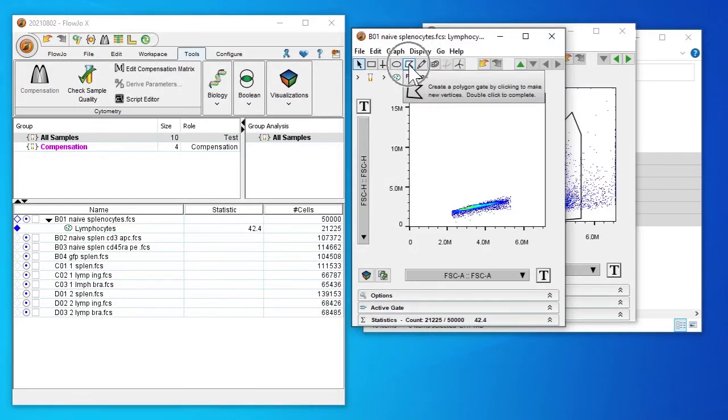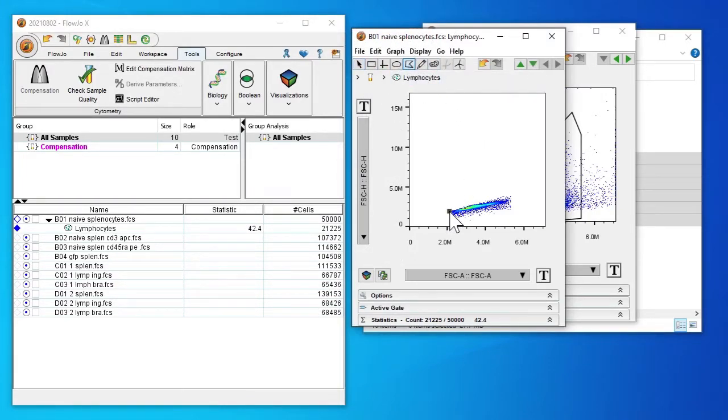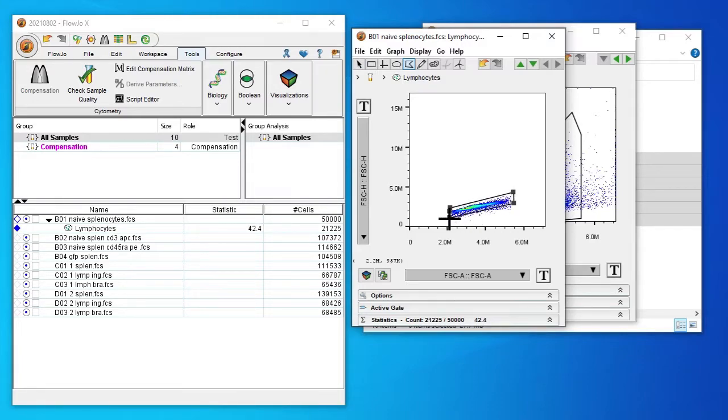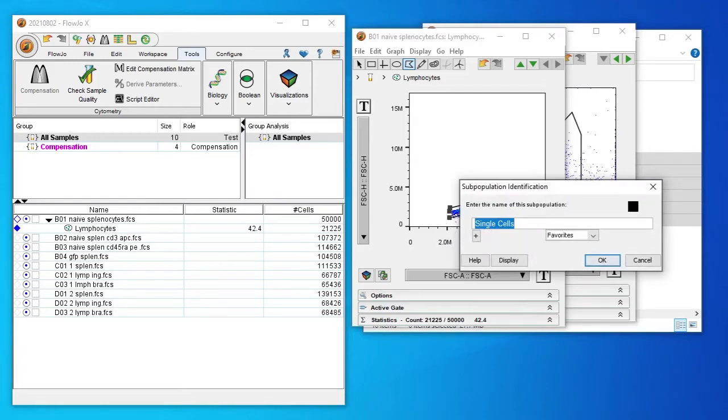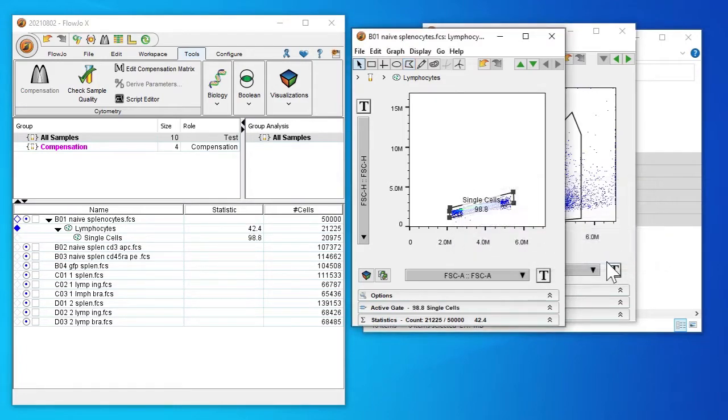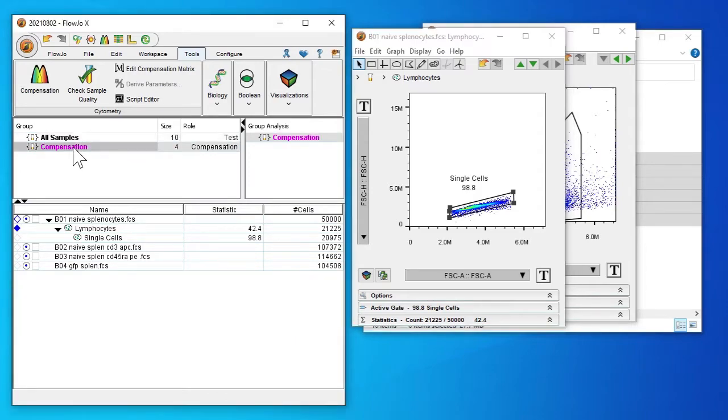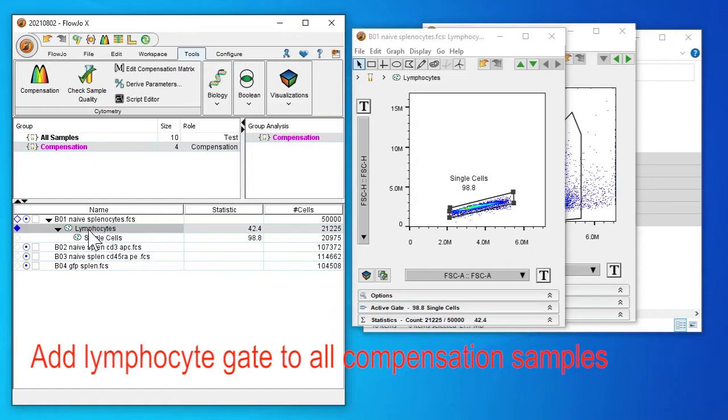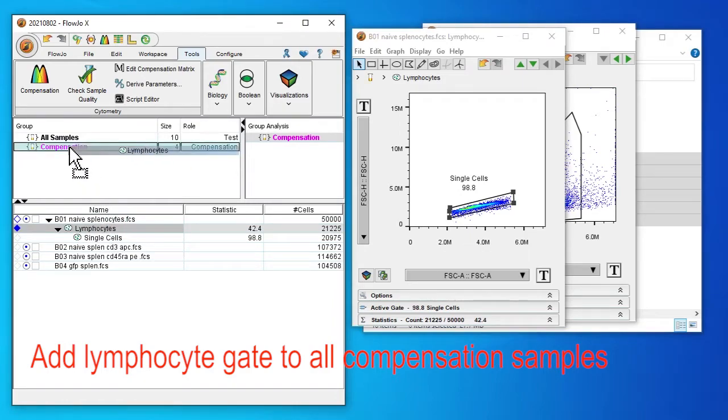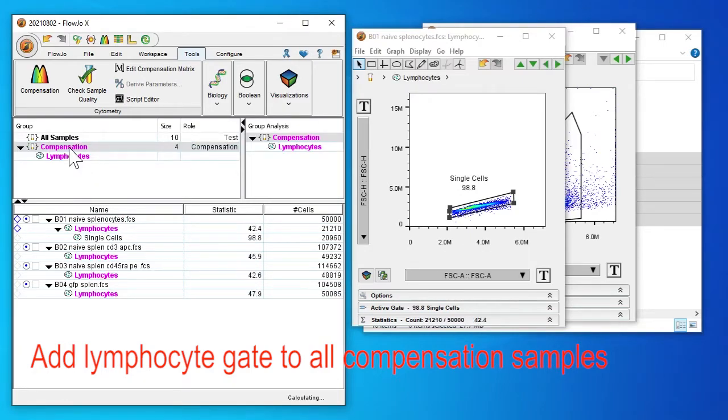I'm going to create a new gate to encapsulate the majority of the population. This will be our single cells. And we're going to apply our lymphocyte gate by dragging it into the compensation set.